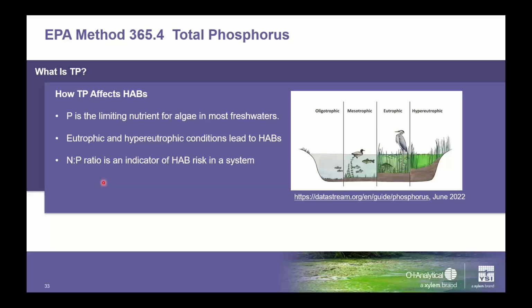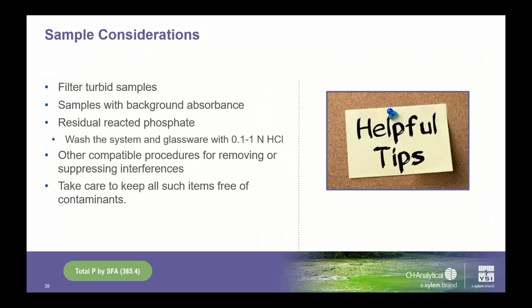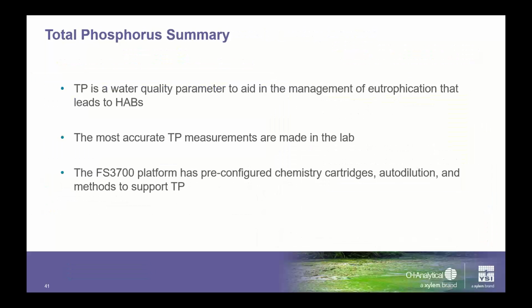So there isn't a one size fits all answer to your question, but there definitely is a relationship and a correlation that you can likely build for your system. I really appreciate that question, because that is a way that you can use the tools we're giving you to get a different level of information when you're doing harmful algal bloom monitoring.